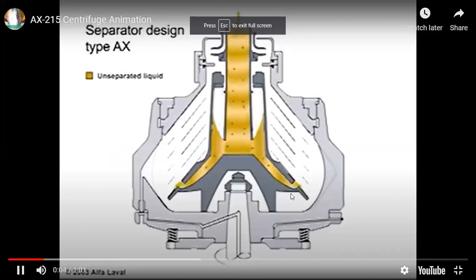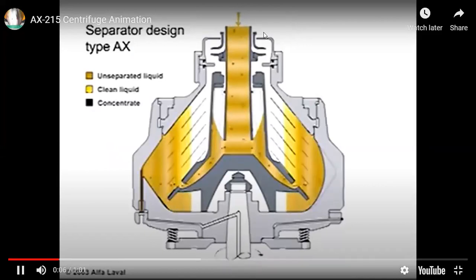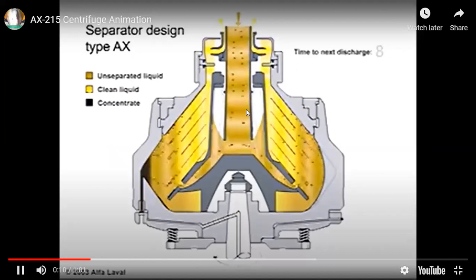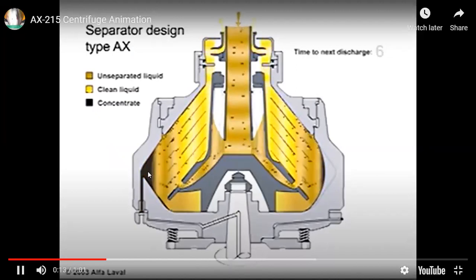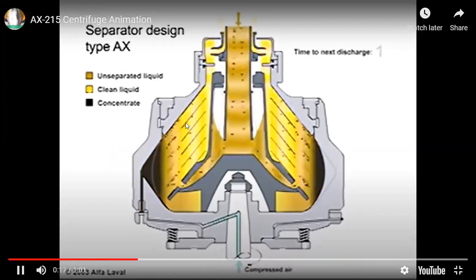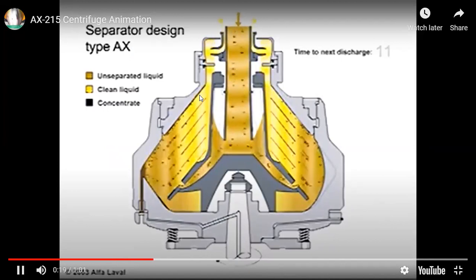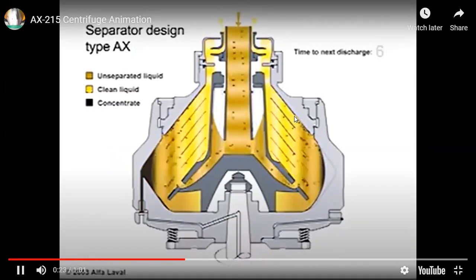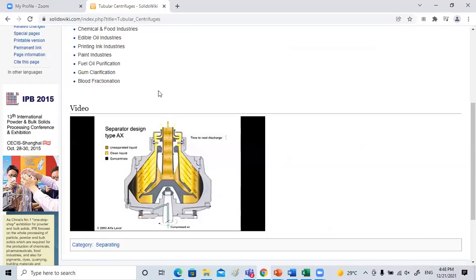We rotate continually when you feed the liquid and solid. Most solid will move to contact with the wall, the outside wall, in this case. These are the operations of the disc bowl. Then you can separate liquid and solid.